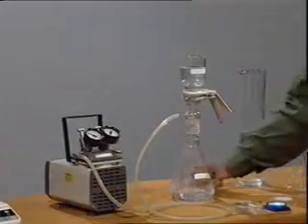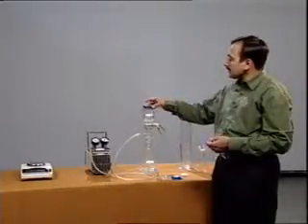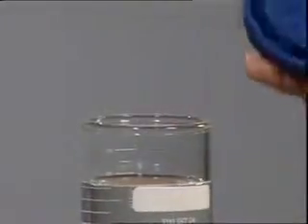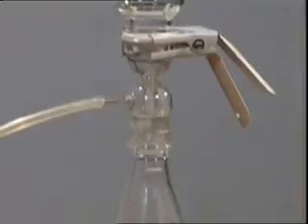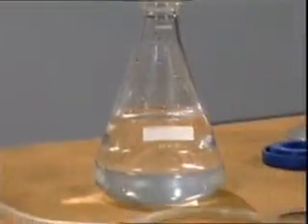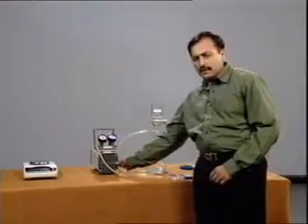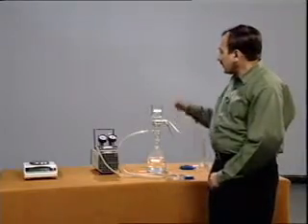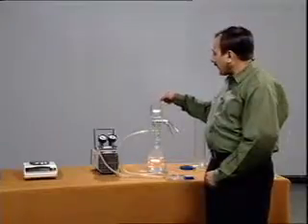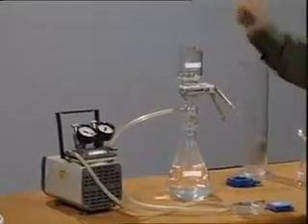If we are working in a dusty environment, we can use this cap to cover the sample, but here we do not require this. Now, after the filtration is complete, switch off the machine. If required, we may put some distilled water on the sides of the funnel to remove any impurities clinging to the surface.